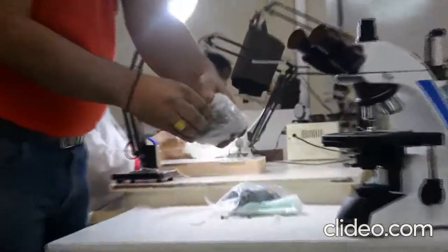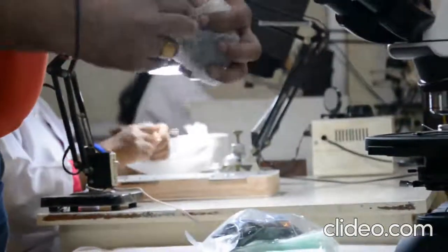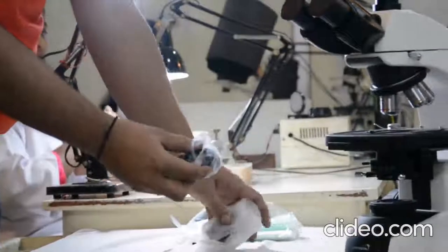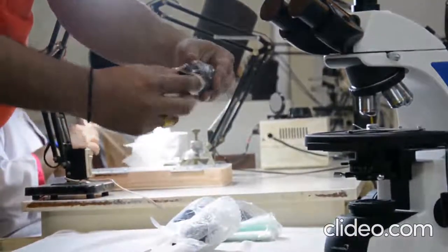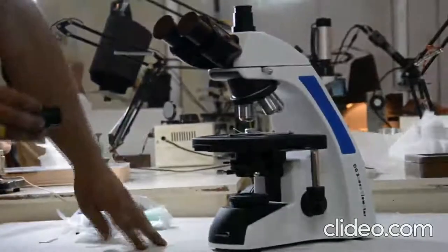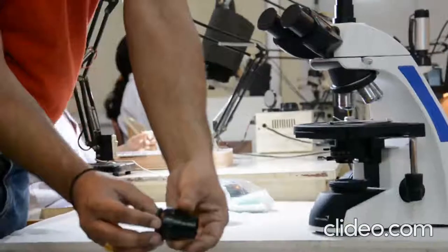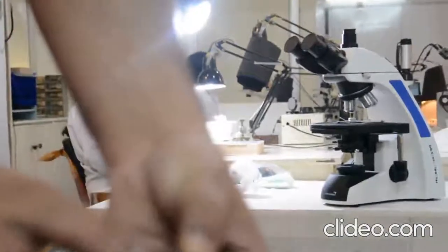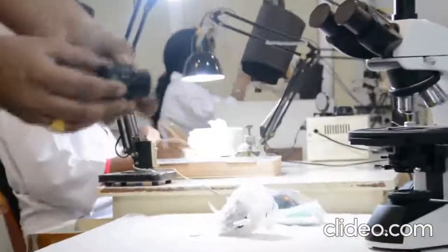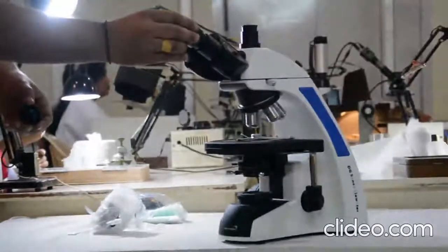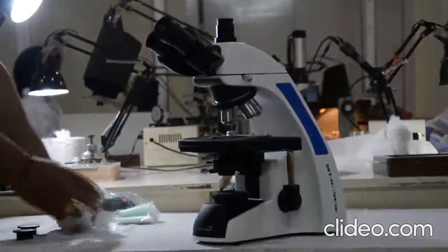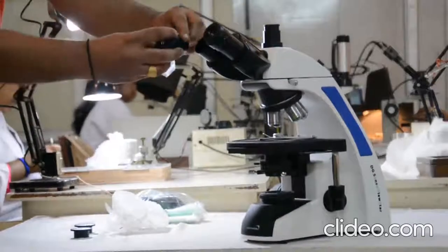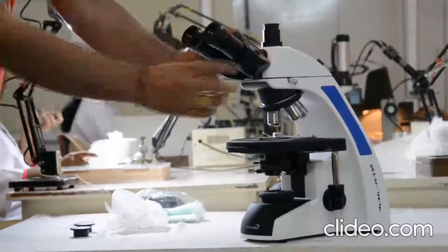Unpack the eyepieces. They are wrapped in bubble paper. Remove the eyepiece cover from the microscope. There is a diaphragm adjustment.